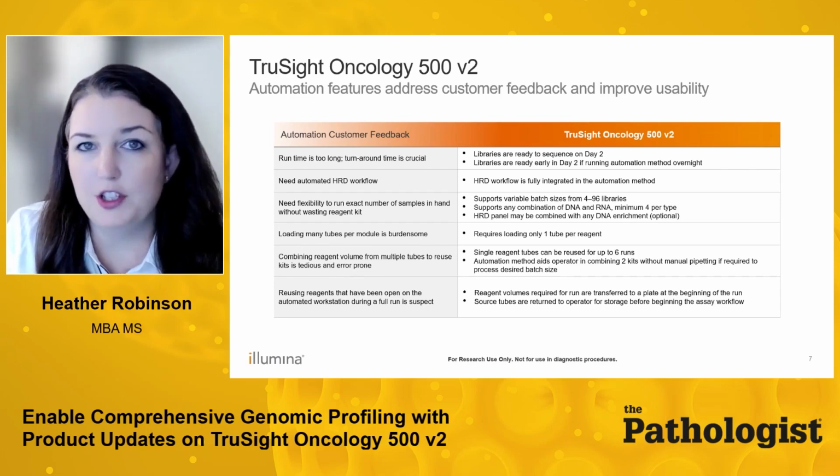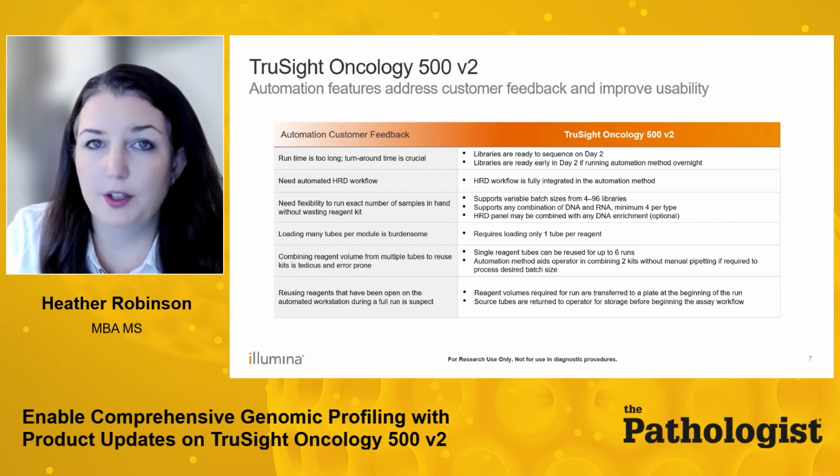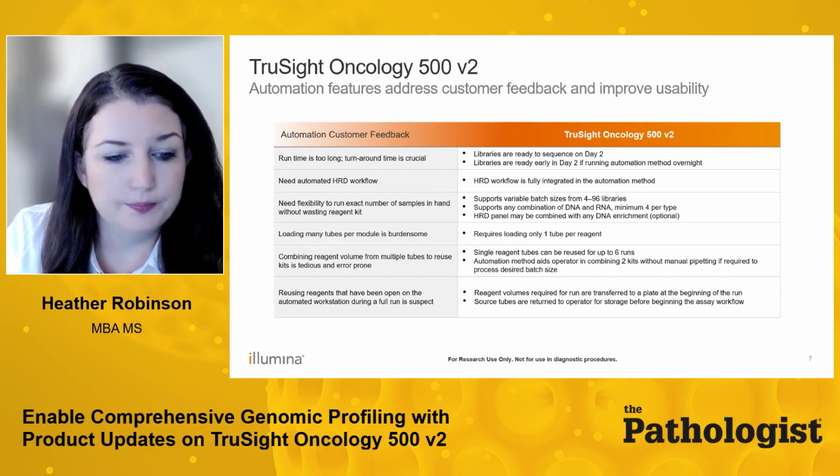And after reagent tubes are loaded onto the deck, the reagents will first be transferred to a PCR plate so the user can return the reagent tubes to storage before the method starts processing samples.